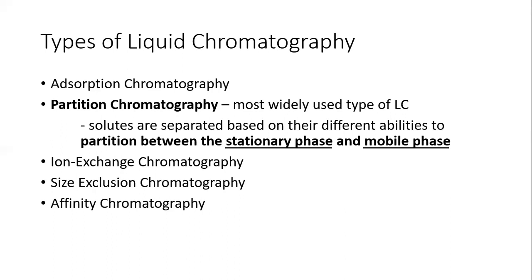So from the word itself, you are just using the HPLC to partition or to separate the different compounds depending on their interaction with the stationary phase and the mobile phase. Okay? So itong iba pang types ng LC, so ion exchange, size exclusion, you will encounter that when you get to your biochem lab. So sa Chem 145.1. So mas ginagamit siya for separation of biochemical, biocompounds, proteins, DNA.